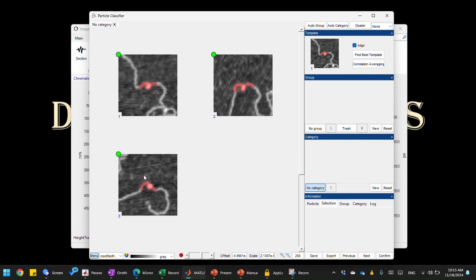And because there may be more than one mask within that region, in this case there are 2, we cannot really display the particle parameters because we don't exactly know which parameters we're looking at, and they cannot be analyzed because these masks are not connected, so they're not a single particle but actually 2 particles, right? So that's the major limitation here, and you can see another spot here.